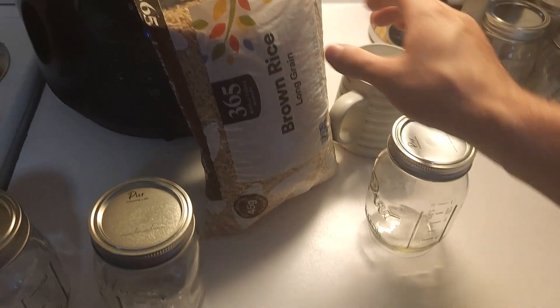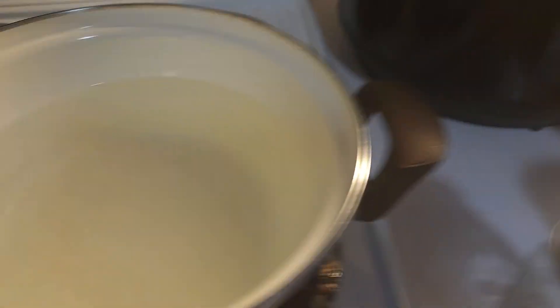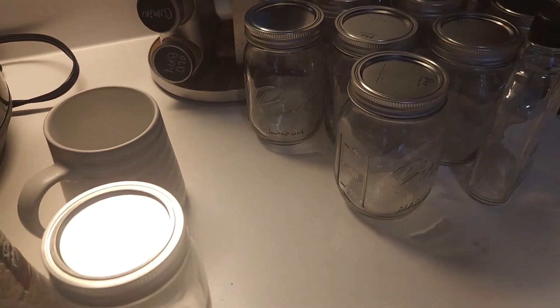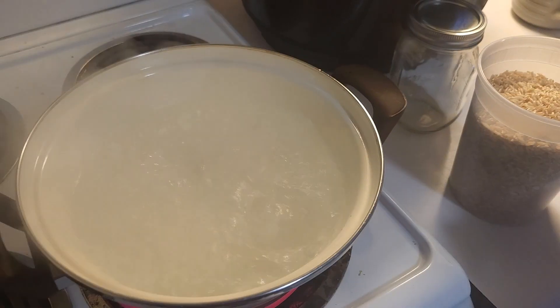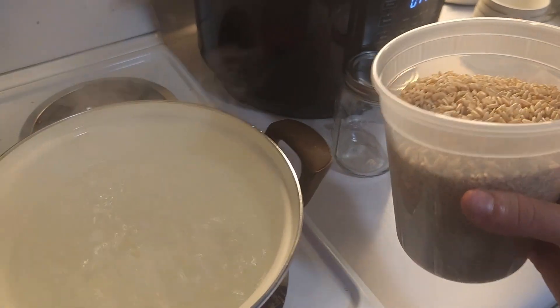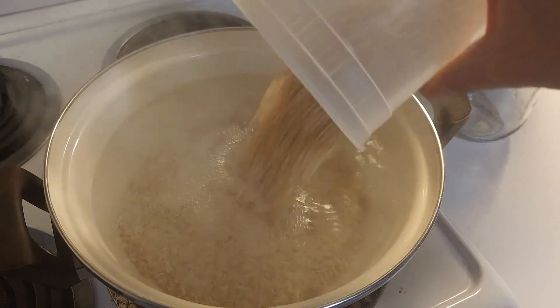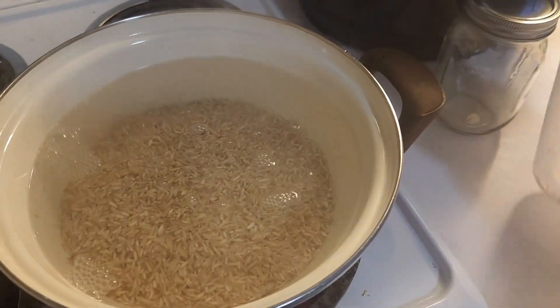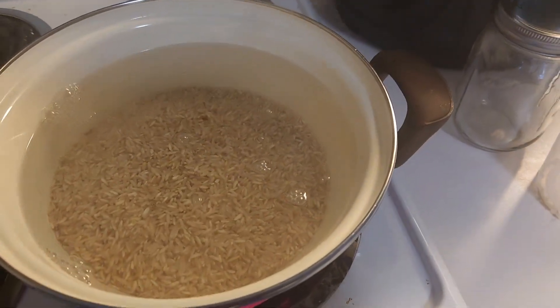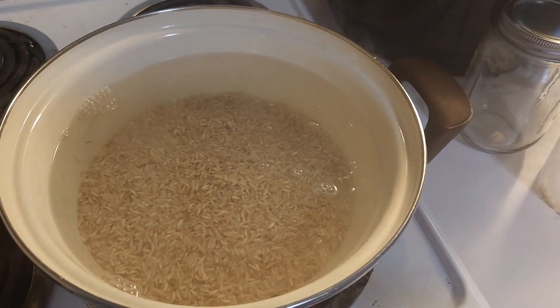We're going to go ahead and prepare some brown rice for spawn. We're going to start with boiling some water, just enough to cover the general amount of rice we need. I have a lot of extra jars off to the side so I'm not concerned about making too much. With our water fully boiling, we're going to add roughly three cups of brown rice — this is not washed or rinsed. Stir occasionally and reduce to a medium simmer for about 10 minutes.